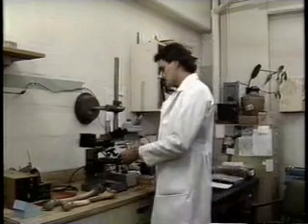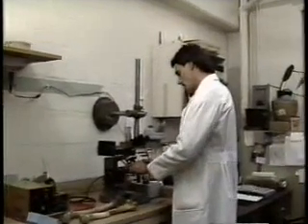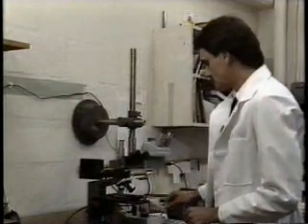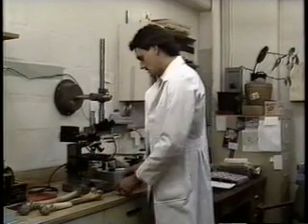As we put a specimen under the microscope, we can see the differences with advancing age. Here's an individual who was in his early 20s, and in this particular field you can see there are very few remodeling structures, the round structures with the concentric circles within these structures, very few remodeling structures in this field. But the formative structures, the original structures in the original formation of bone, are still present, the circumferential lamellar bone and the non-haversian canals.